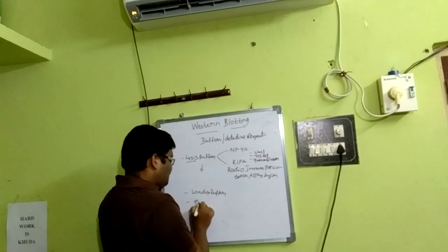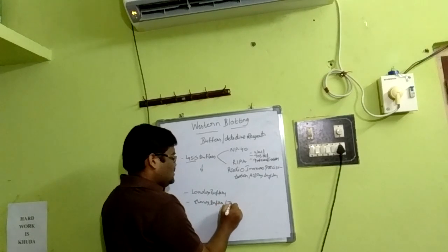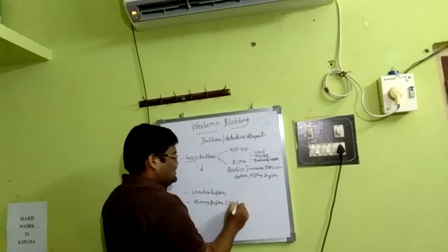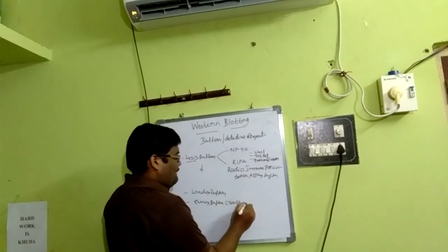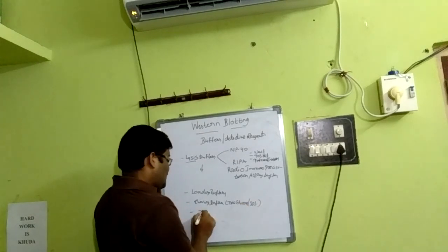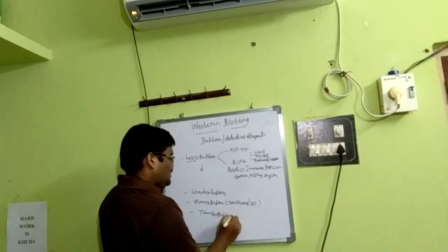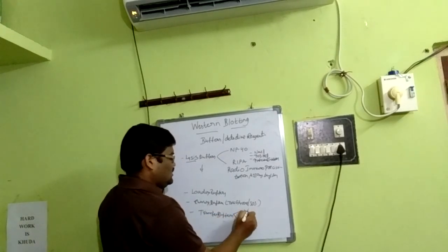Then the running buffers, say Tris glycine SDS. Then transfer buffers, which are of two types, wet and semi-dry.